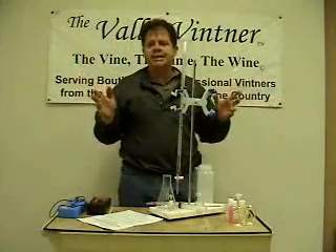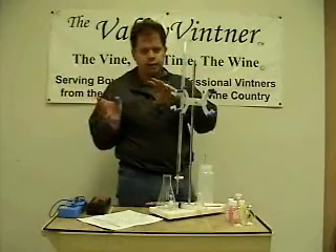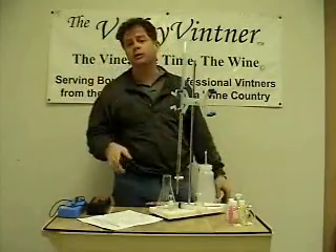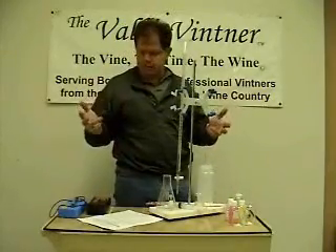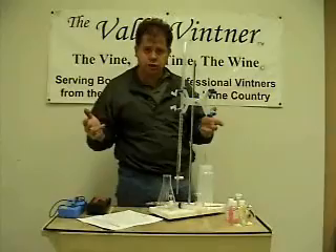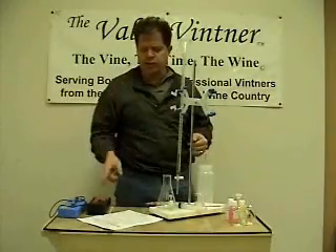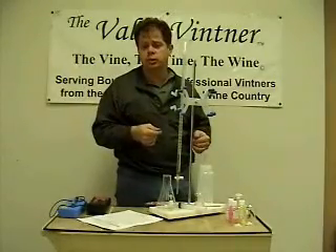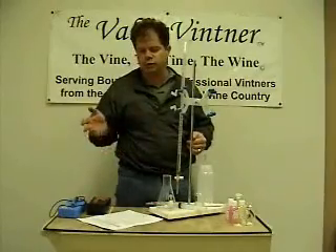Today we're going to learn how to measure TA using a titration stand and a pH meter. No more looking at little drops of indicator solution and swirling it, trying to see an end point in a red wine. We're going to show you a very simple and effective professional method to measure your TA, total acidity, using a pH meter and titrating 0.2 normality sodium hydroxide into your sample until the pH meter reads 8.2.